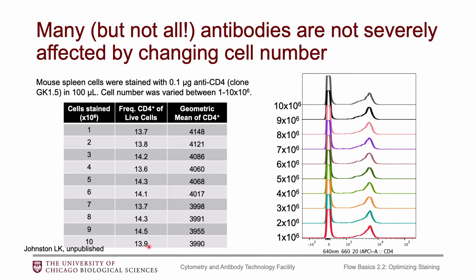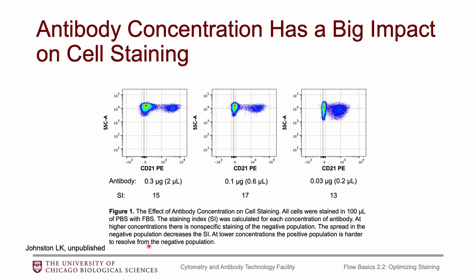Just because this worked for CD4 doesn't mean every antibody will behave this way — some antibodies are more sensitive to cell concentration. But in general, if you have to change cell concentration for whatever reason, it's not as much of an issue. On the other hand, antibody concentration has a really big impact on your results. In a similar experiment where I varied only the amount of antibody, you can see how much the data changes between tubes. So concentration is extremely important for antibodies and less important for cells.